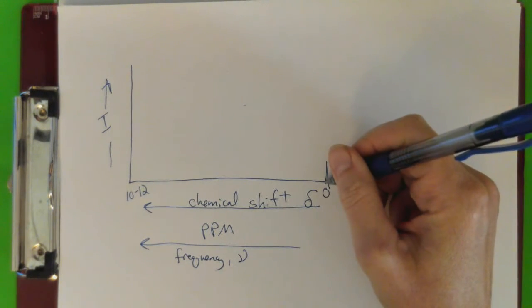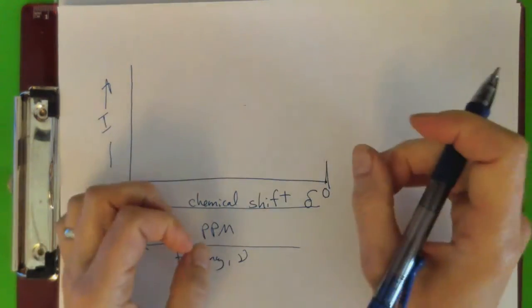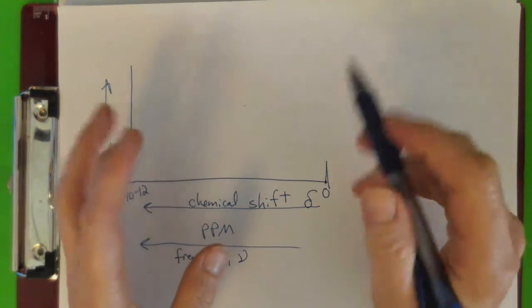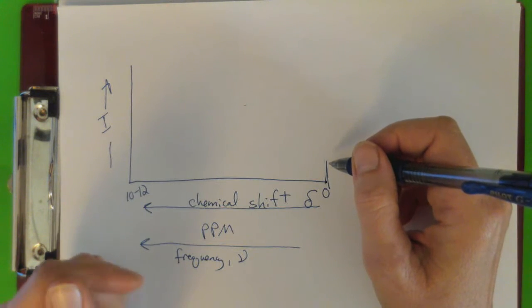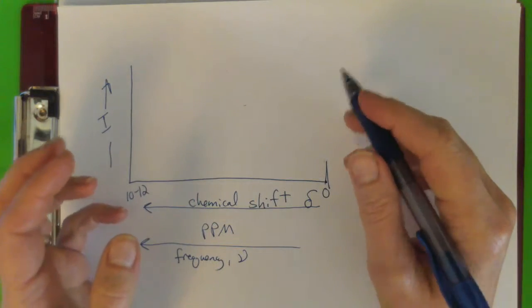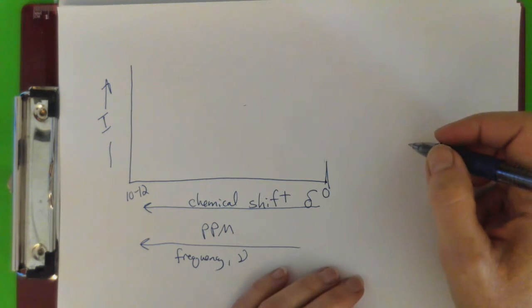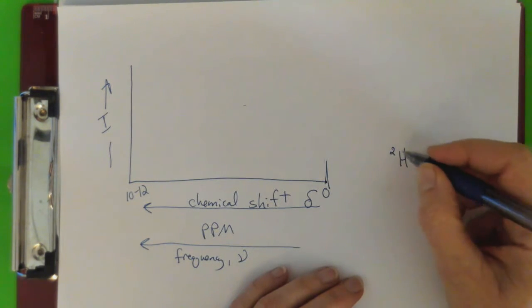Okay, so usually at 0, when you take your NMR spectrum, so imagine in the lab, you've isolated your compound, you synthesized it, purified it, right? Usually you end up with some kind of solid, let's say, and you want to take the NMR spectrum of the compound. You're going to have to put it in a solution. It needs to be in a liquid state. So you're going to dissolve it in a deuterated solvent, meaning you have H2 instead of H1.